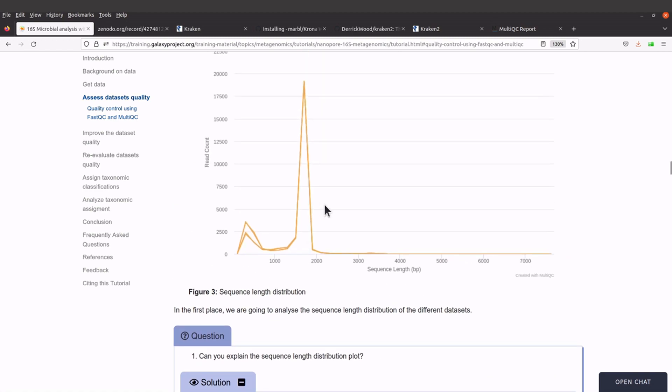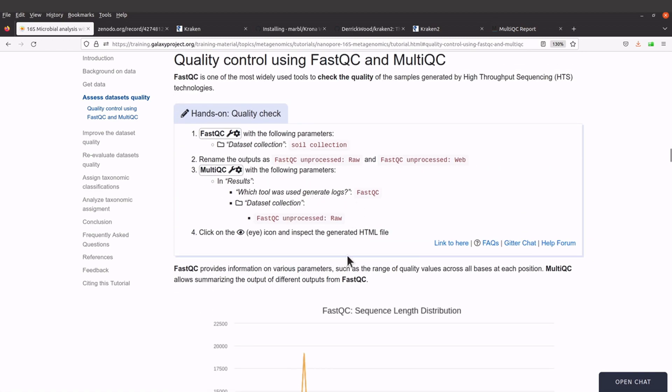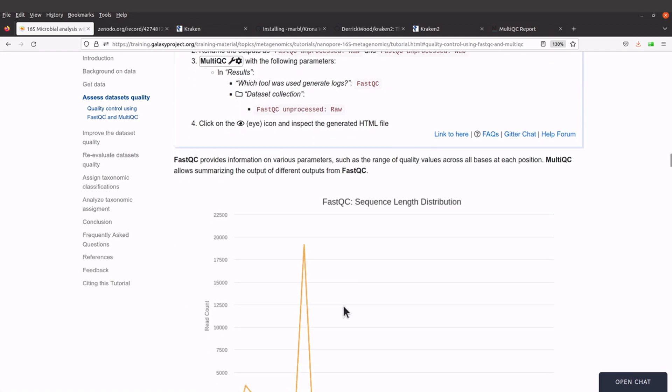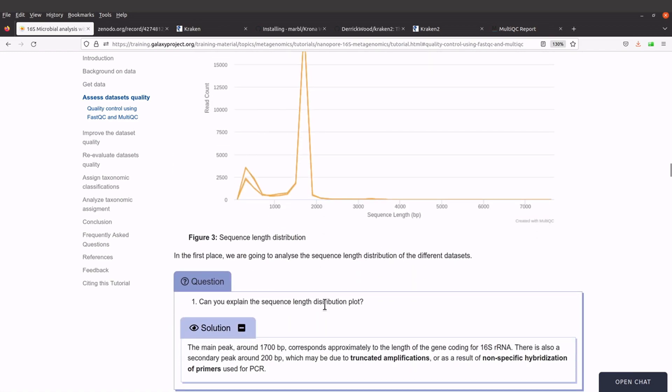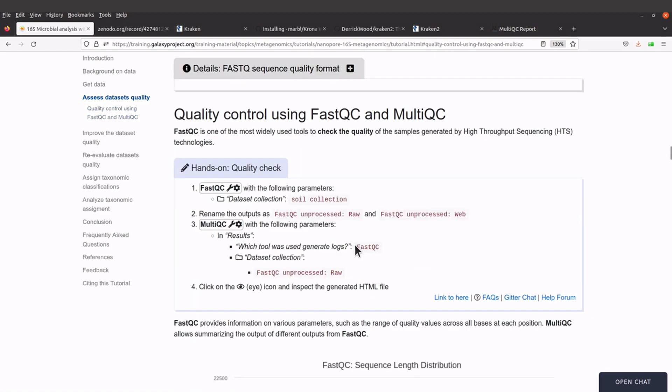I will encourage you to read the documents here, check the explanation, and this will help you get a better understanding of your data. We are using the data here and you can transfer the knowledge to your data as well. It's just a matter of applying what you have learned.